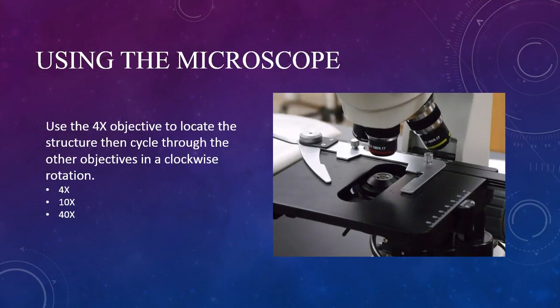Now we want to begin actually examining the specimen. We begin with the 4x objective, because this shows us the greatest amount of our specimen in the field of view, making it easier to locate the specific structure we're looking for.